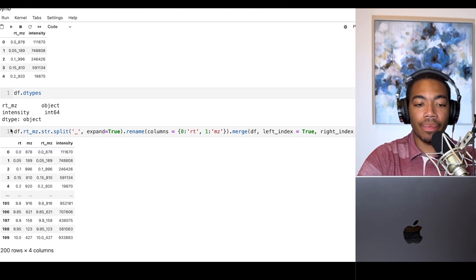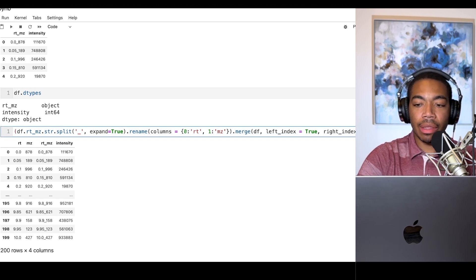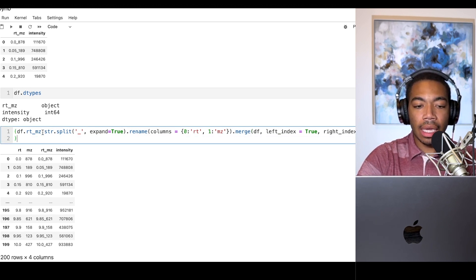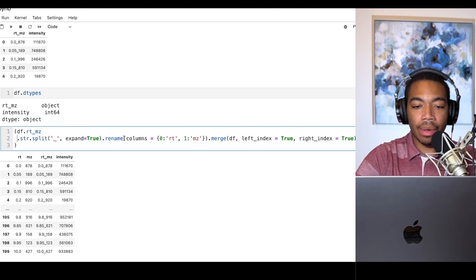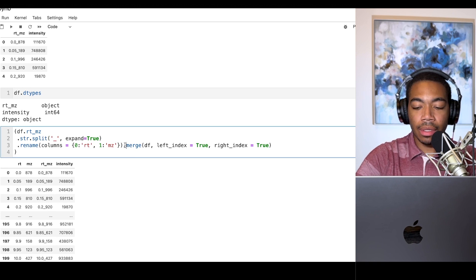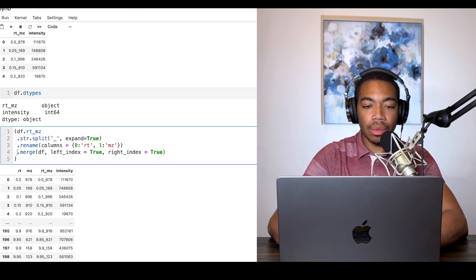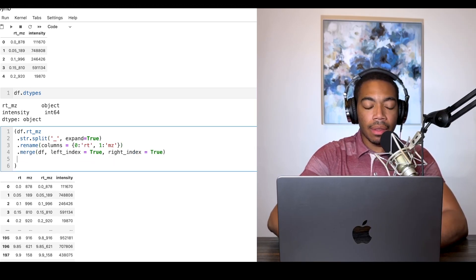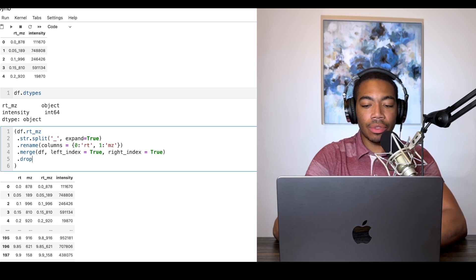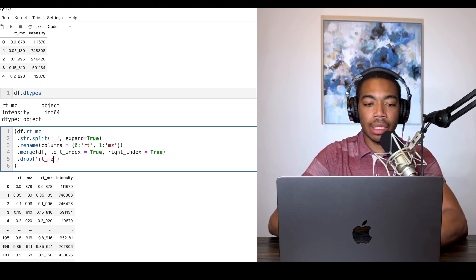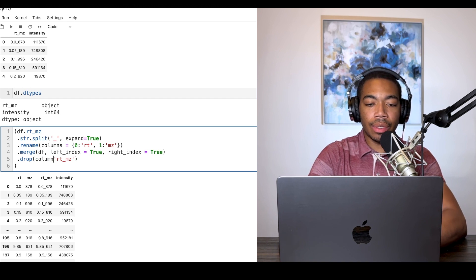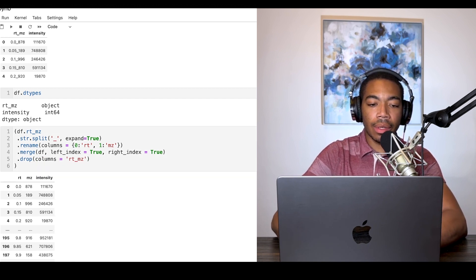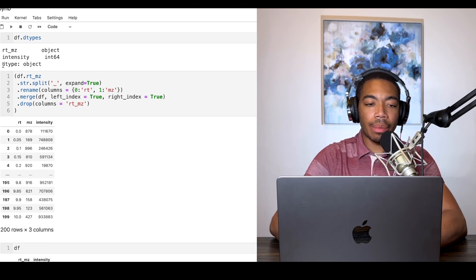When we're chaining methods we can wrap this whole thing and then allow us to improve visibility by splitting the methods onto new lines. The last thing we want to do is now drop our rt_mz column and we just pass in the column equal. Now we have our cleaned up dataframe.